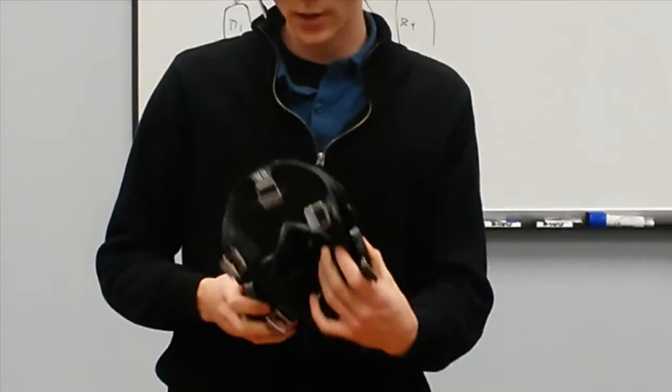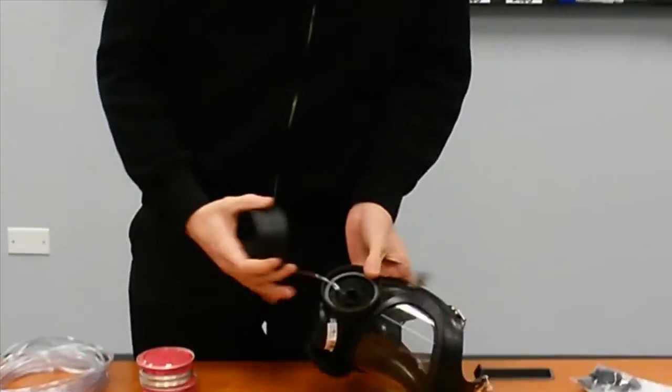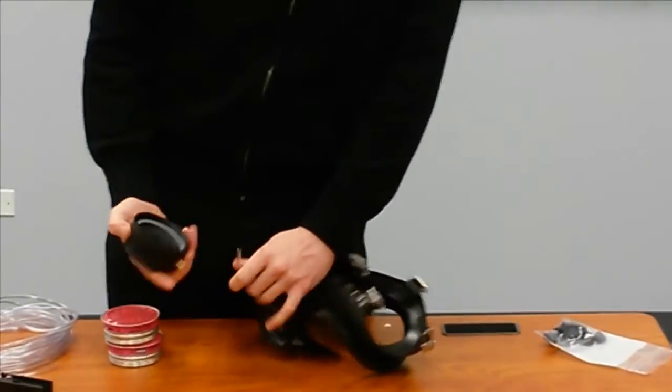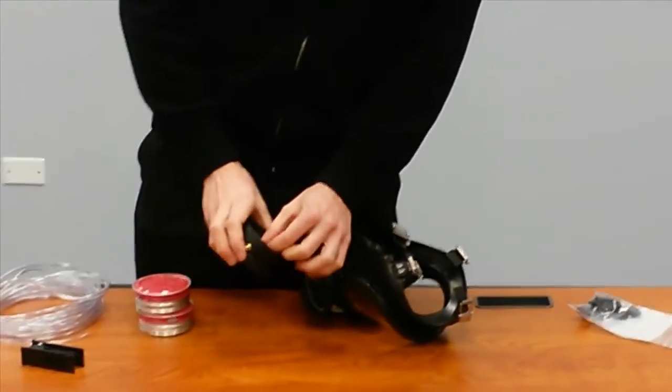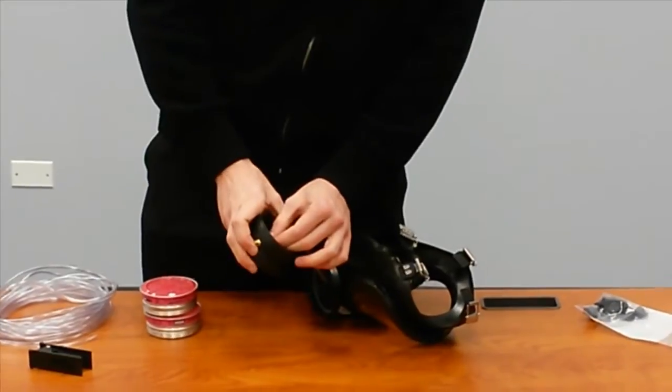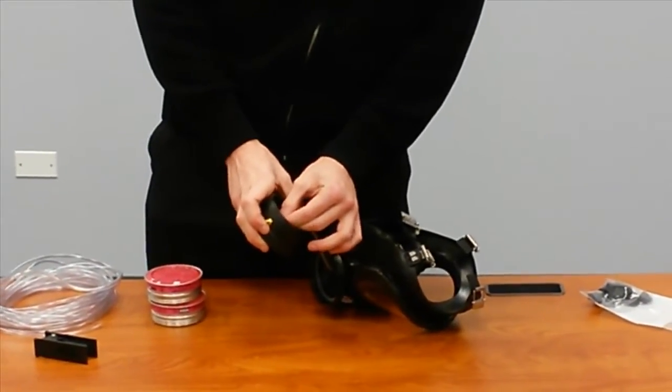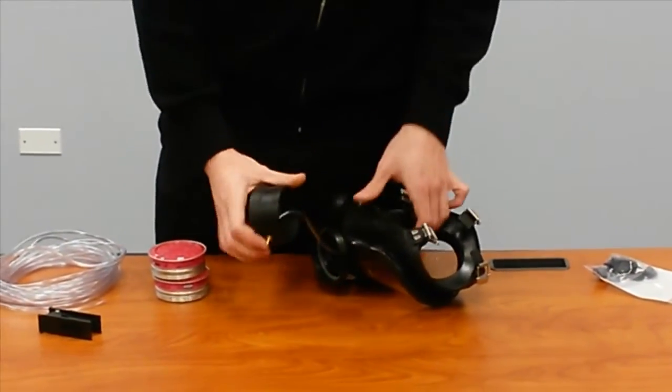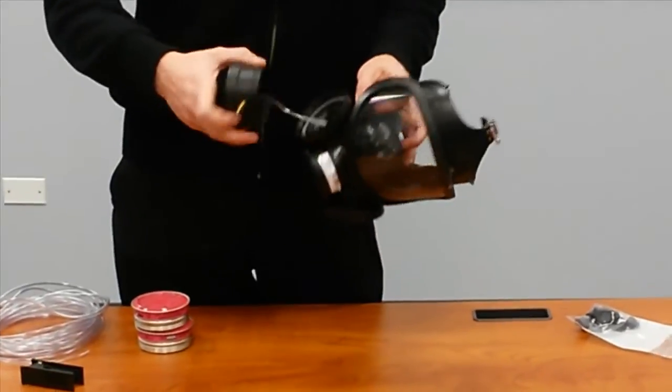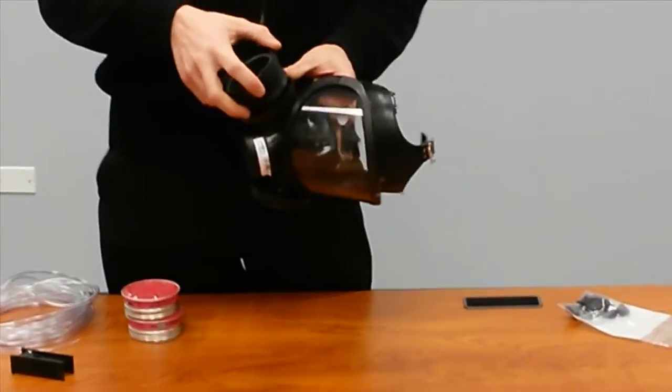Now that's attached, you can go ahead and attach the probed adapter piece to the tubing. Once you have that attached, you can attach the adapter piece to the mask.